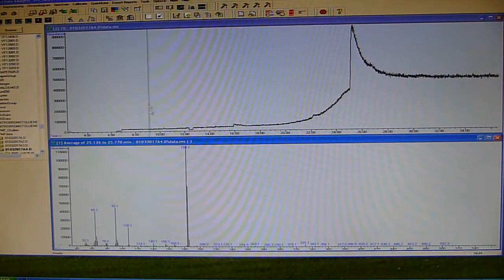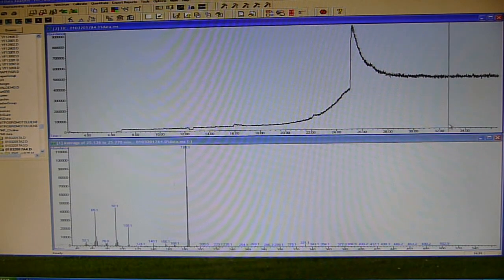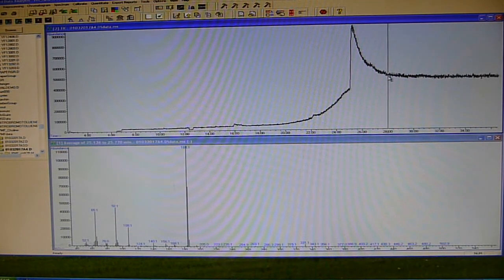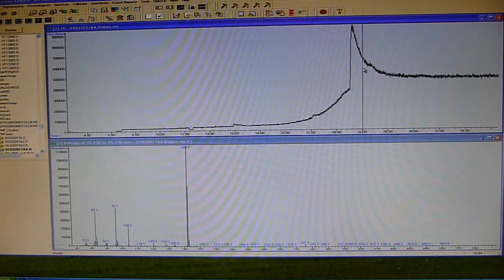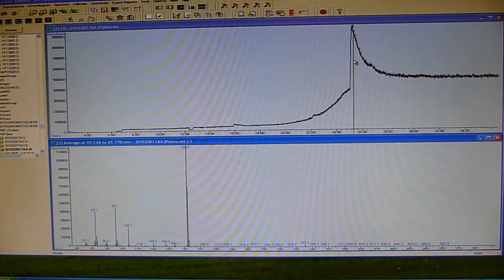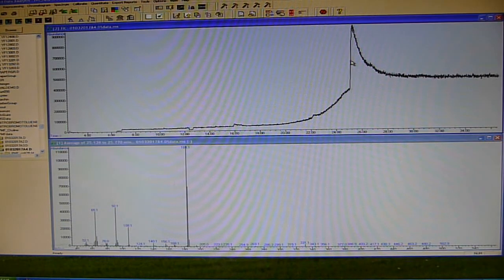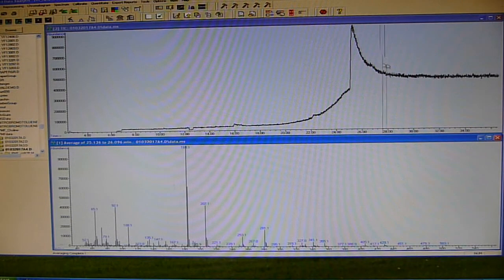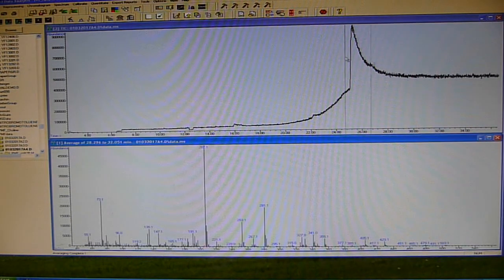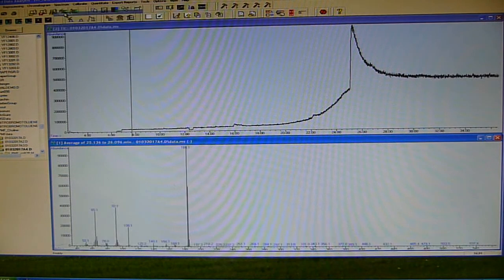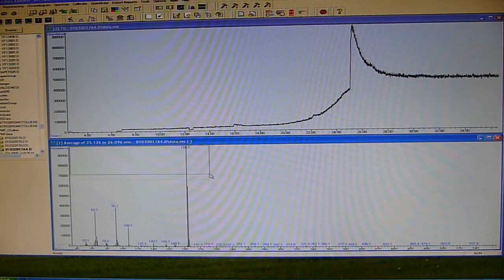Here we have our total ion chromatogram. The GC chromatography is not the world's greatest - the point is just to get some sort of separation for the sulfapyridine. If we average across the peak, take some background spectrum and subtract, we get this spectrum. Let's zoom in here up to about 280.